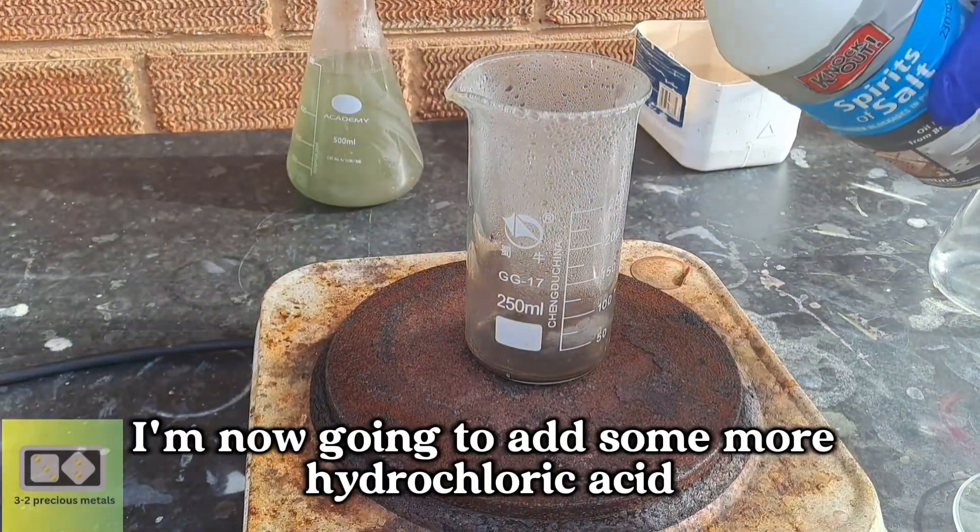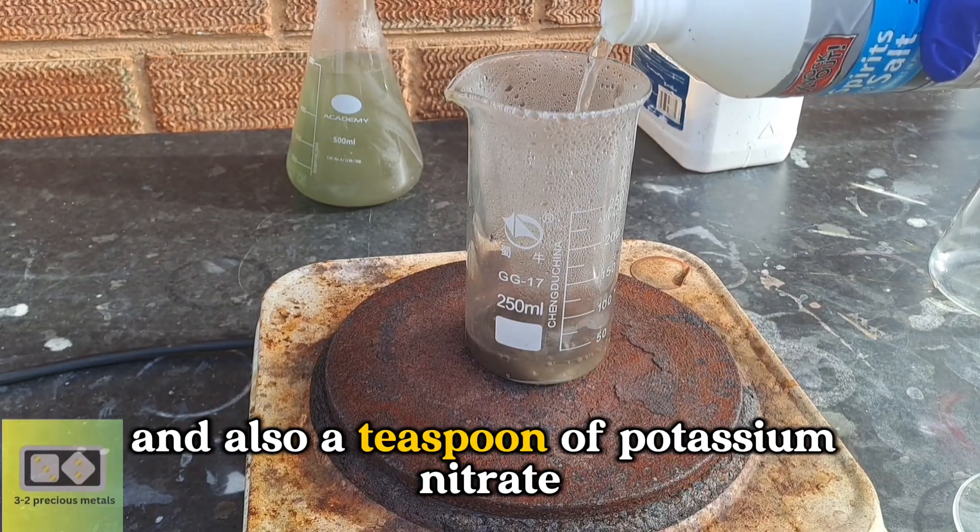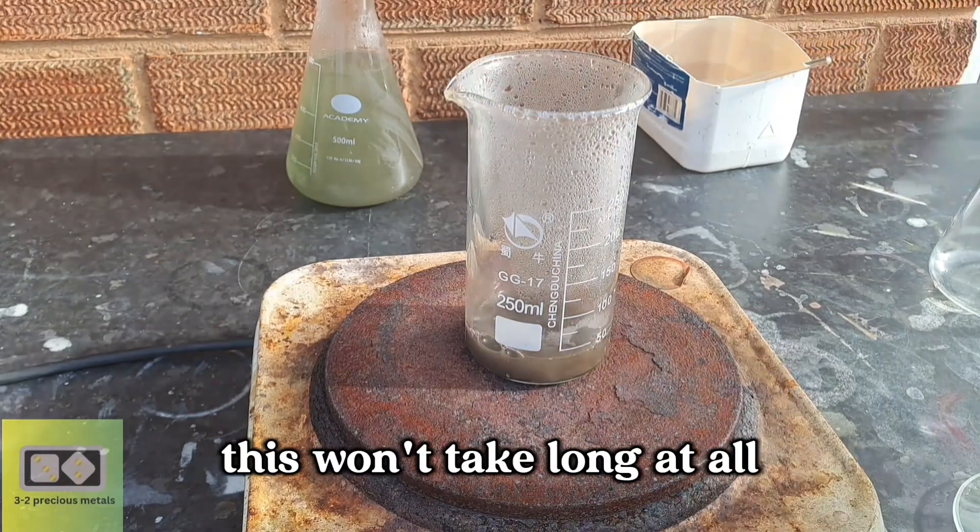I'm now going to add some more hydrochloric acid and also a teaspoon of potassium nitrate to get this gold dissolved. This won't take long at all.